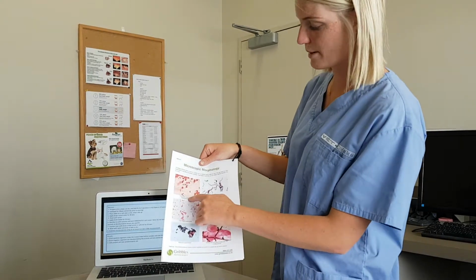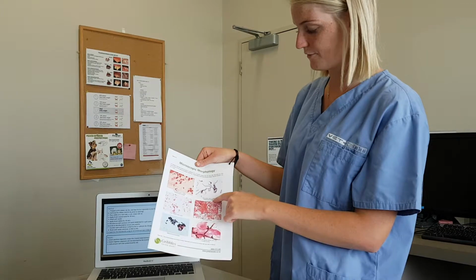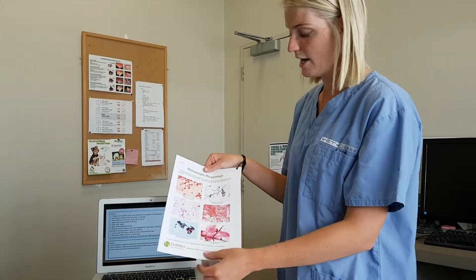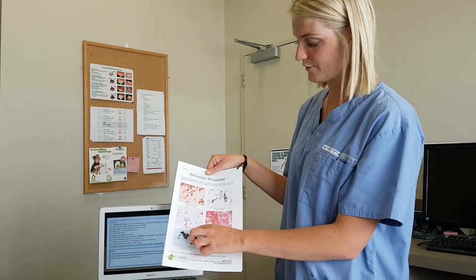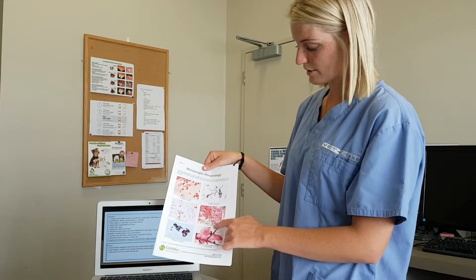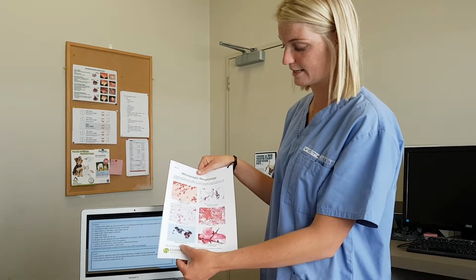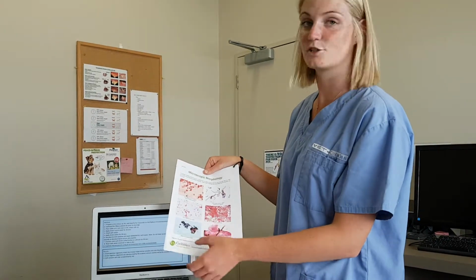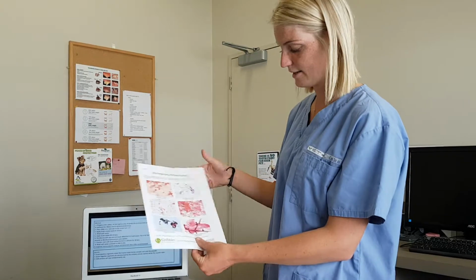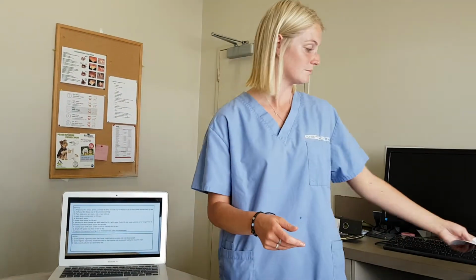So this is our gram-positive cocci, and then we've got gram-positive cocci in chains, and that is in clusters. Then we've also got gram-negative bacillus, and then gram-positive bacillus, and then we've got the Malassezia, which is normally found in ears, and then budding yeast is what you can see under the microscope, then gram staining.